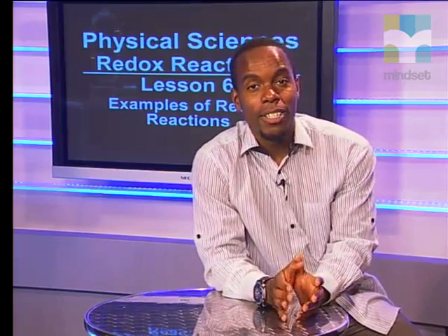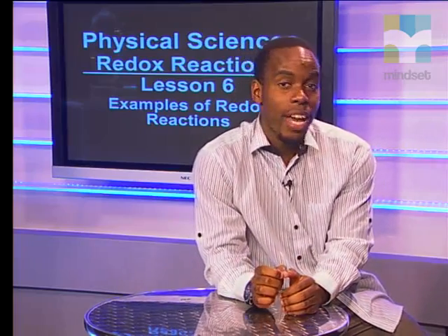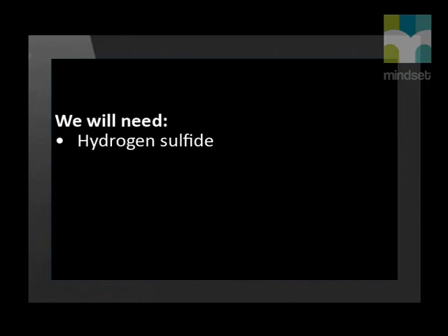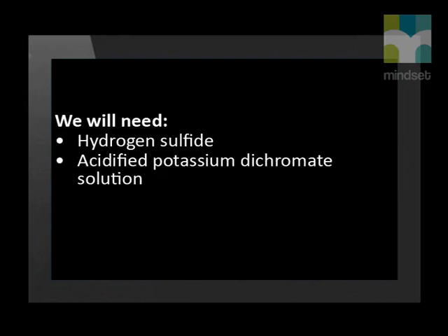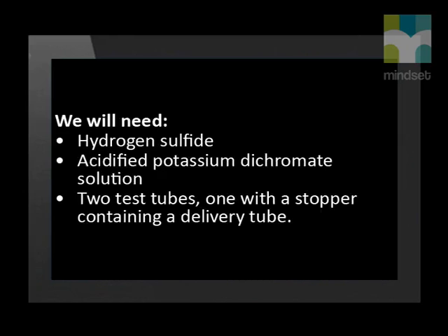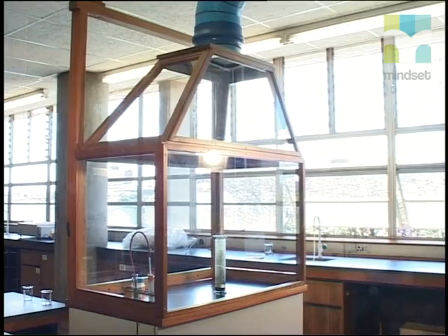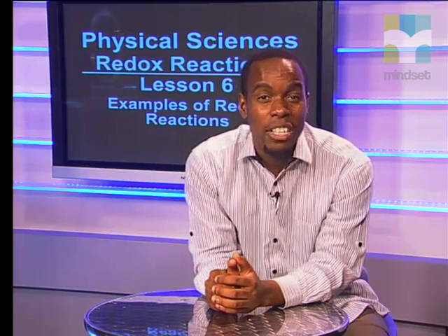In this experiment, we will investigate the reaction between hydrogen sulfide and potassium dichromate. We will need hydrogen sulfide, acidified potassium dichromate solution, two test tubes, one with a stopper containing a delivery tube. Please note that this experiment must be carried out in a fume cupboard. Hydrogen sulfide has a horrible rotten egg smell and is also very toxic.